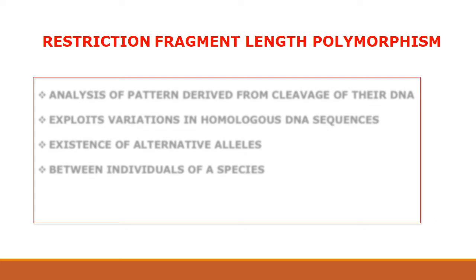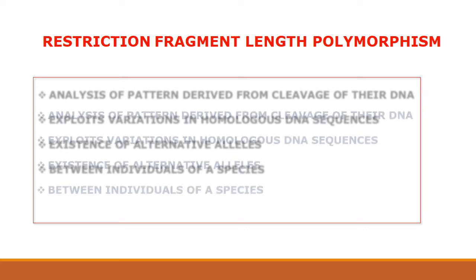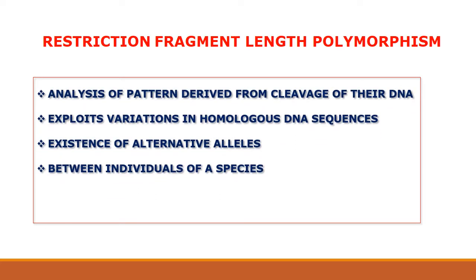Restriction fragment length polymorphism is a technique in which organisms may be differentiated by analysis of patterns derived from the cleavage of their DNA. It is a technique that exploits variations in homologous DNA sequences. Here, by homologous I mean the same type of DNA sequences.